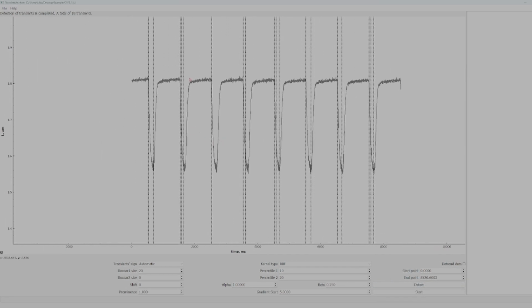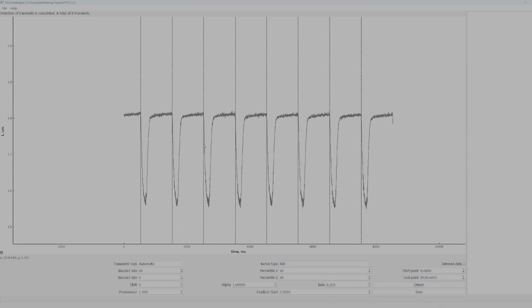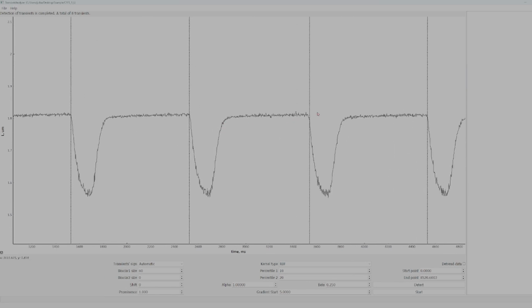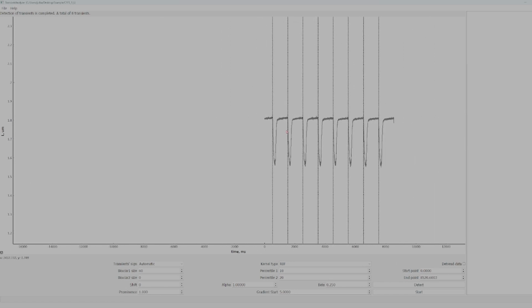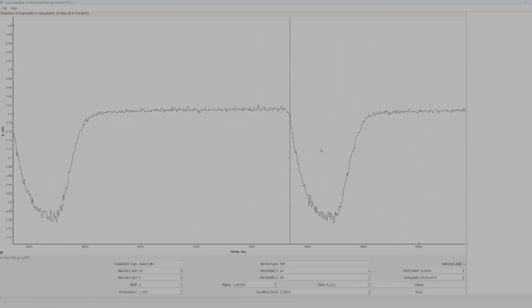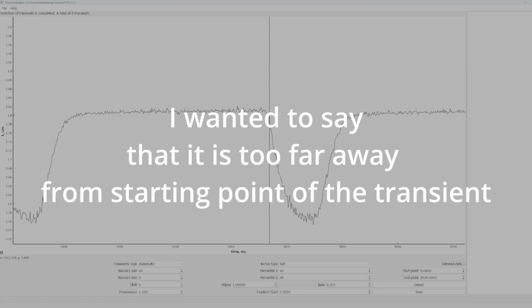You see that in this case, this detection is not so good. First, we can try boxcar size, just increase it. I don't know, maybe some 60 or... Oh, it helped. Perfect. But again, you see that on the first view, it looks fine. But when you go deeper, it is too close. I will give 2 more points or something.